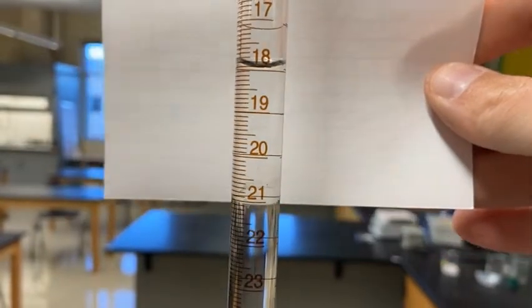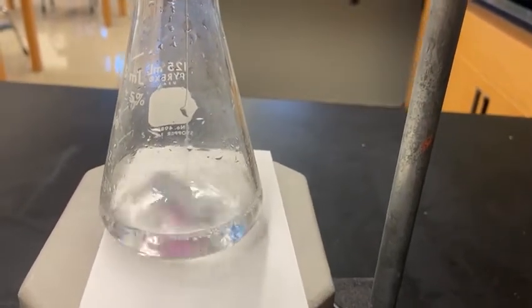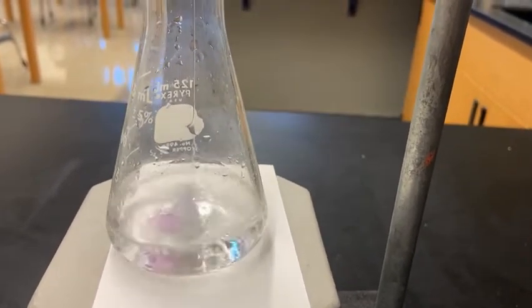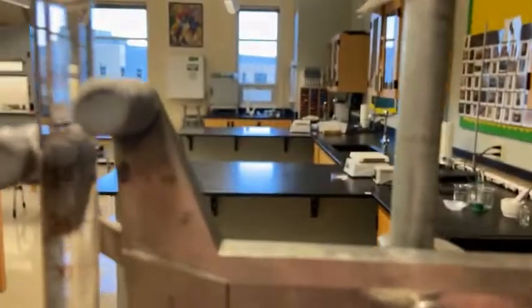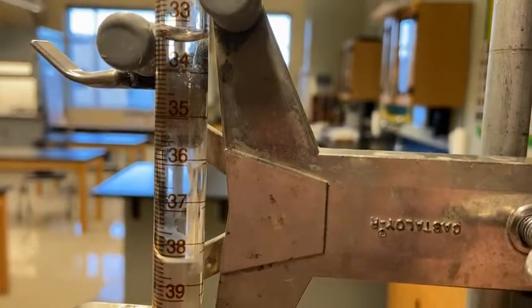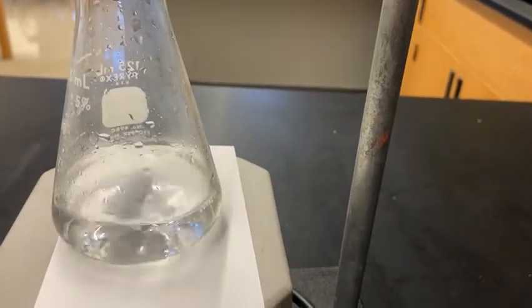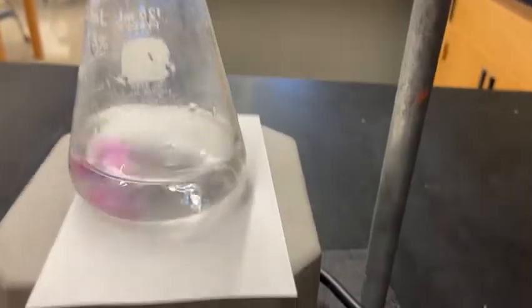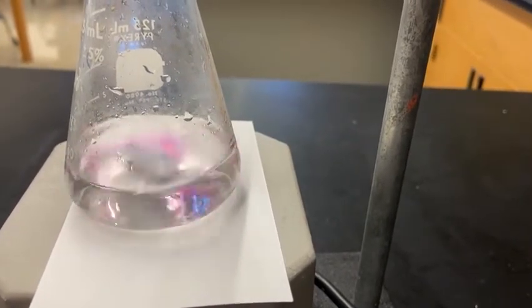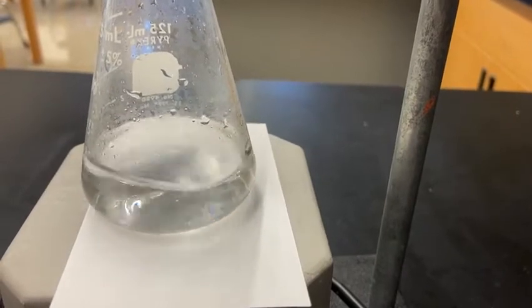Let's get started with Trial 2. I'm going to use the stopcock to release sodium hydroxide and run it pretty fast, just like last time. This time I know it will take around 34 to 36 milliliters on the burette, so I'll run it fast until I get to about 34, then slow down. You can see it's running down — we're almost to 34. I'll stop there. It's still acidic, so we haven't reached the equivalence point yet. Now I'll open it very slightly so it comes out drop by drop.